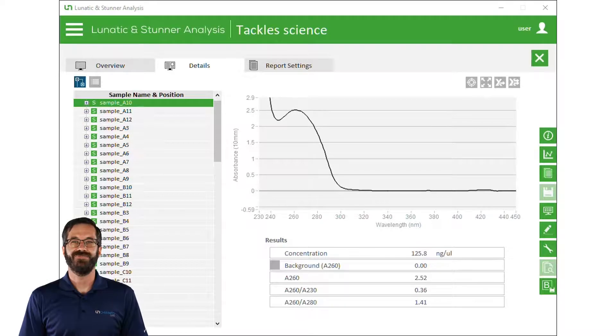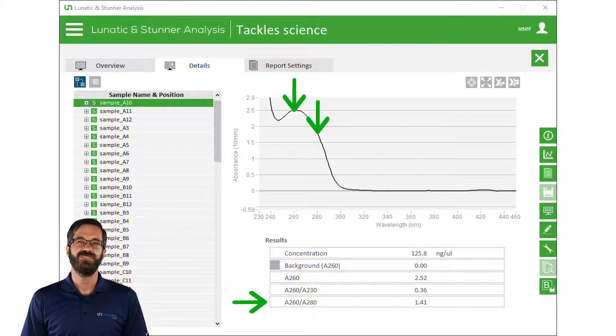Here are the results for one sample. Depending on how purification is done, nucleic acid samples can be messy and full of impurities that absorb UV light and interfere with quantification. Old UV-Vis systems use things like the A260, A280 ratio to tell if that is happening.